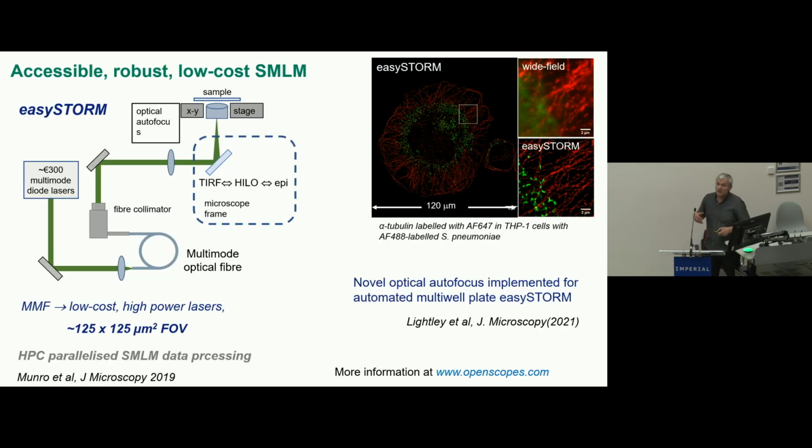Now, in the Black laboratory, we build these instruments. This is the device. The sample goes here. Here is an objective lens. And we use a source of illumination; the light goes through this multi-mode fiber. And in this way, the sample is illuminated. The irradiation that we use is probably 1,000 times the amount of energy that you use for conventional fluorescent imaging or even confocal.